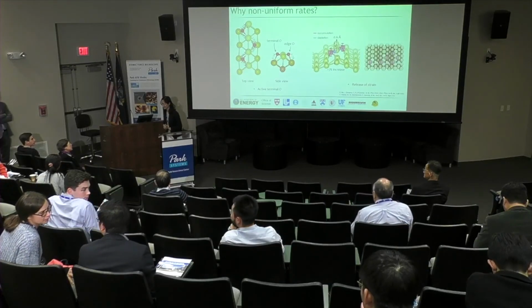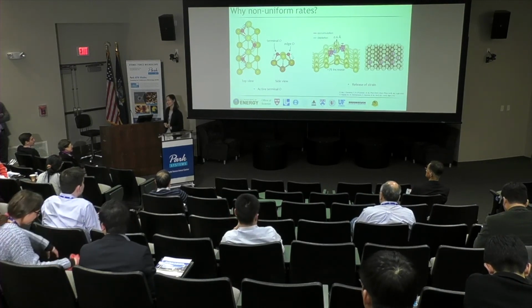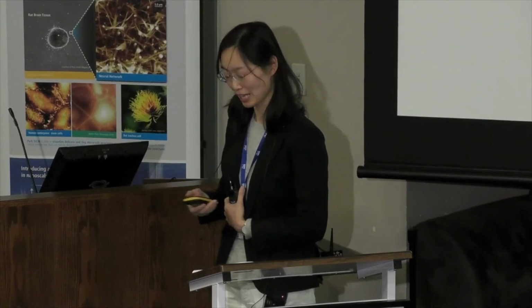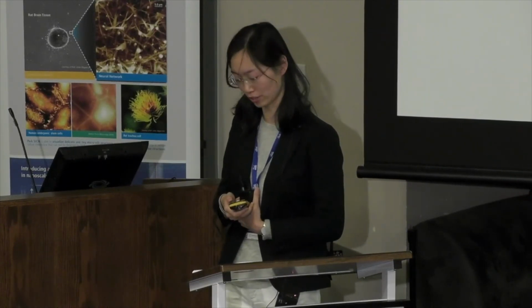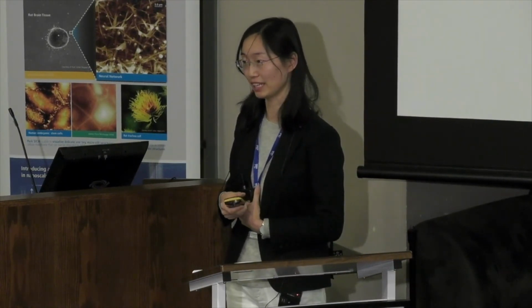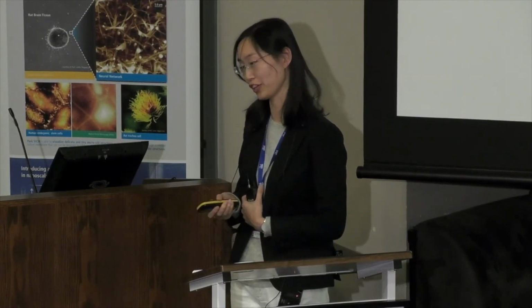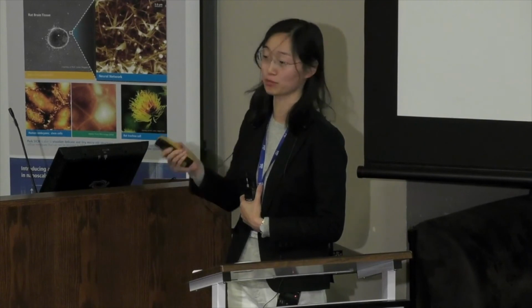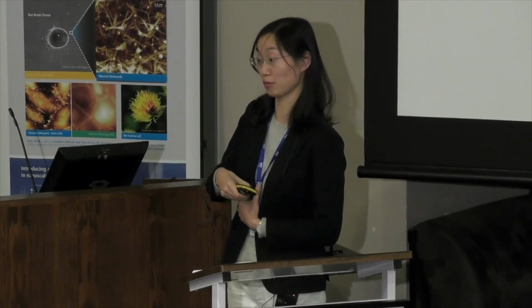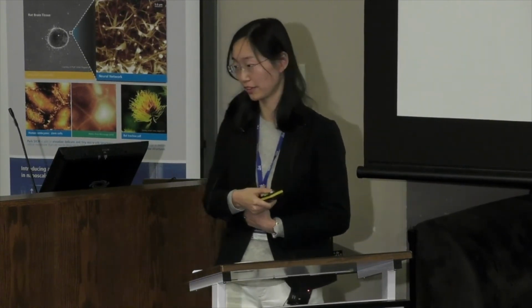I have a quick question. How do you measure the strain? Yes, so the strain release is actually not something I can measure. We looked into the literature, and there are theory calculations on a very similar structure. They have oxygens absorbed on, I think, palladium 100, a very similar structure. And theoretically, they calculate their strain related to that. So once the oxygen is no longer there, the surface goes back to the most stable structure, and you don't have that strain anymore. So once these oxygens are consumed, we say there is a strain release.